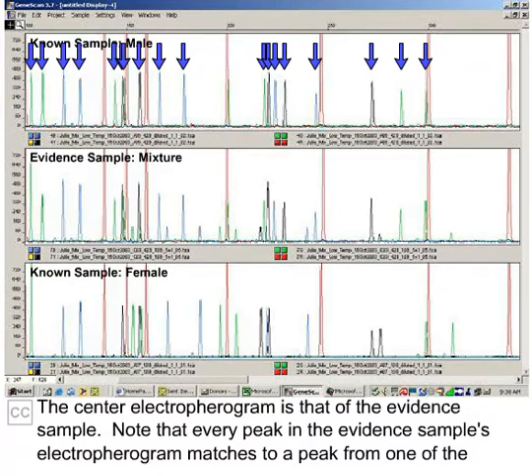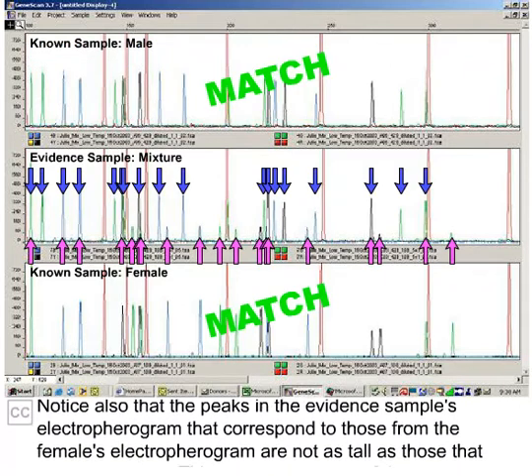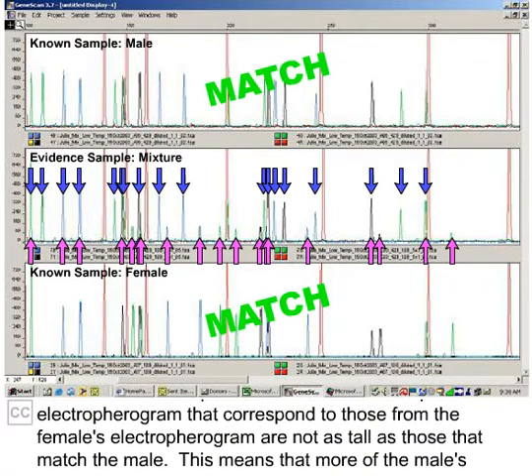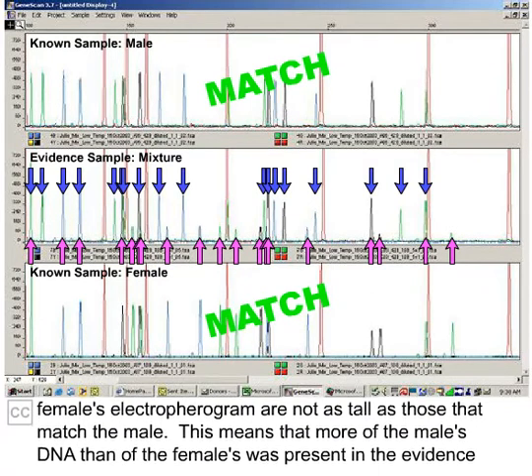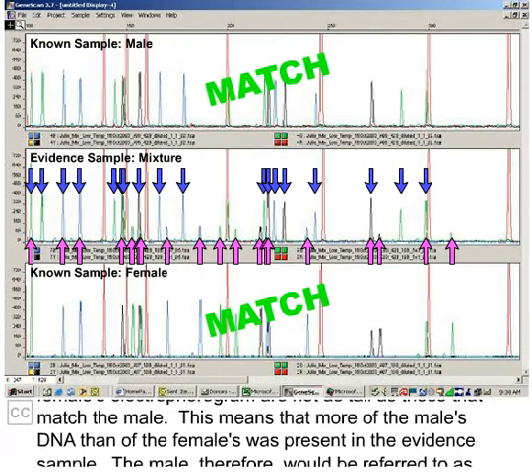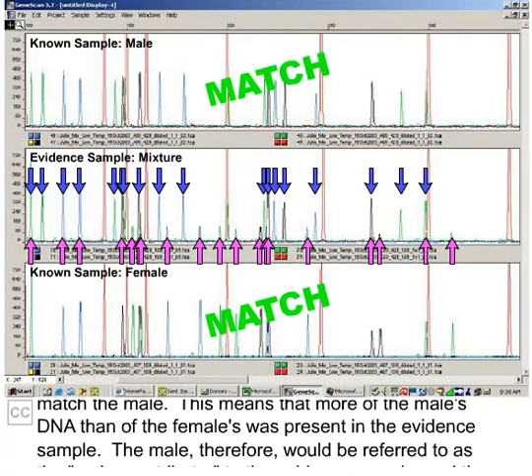Notice also that the peaks in the evidence sample's electropherogram that correspond to those from the female's electropherogram are not as tall as those that match the male. This means that more of the male's DNA than of the female's was present in the evidence sample.